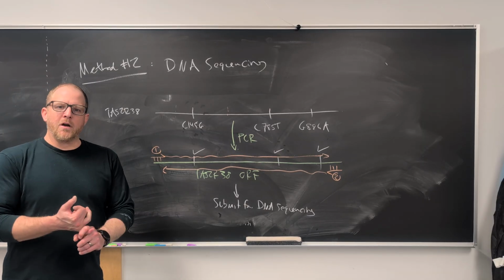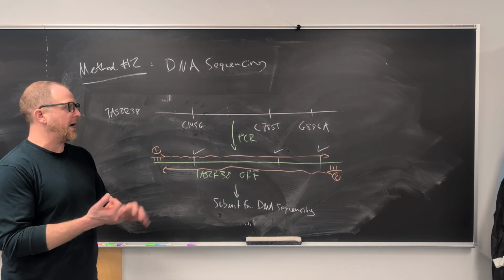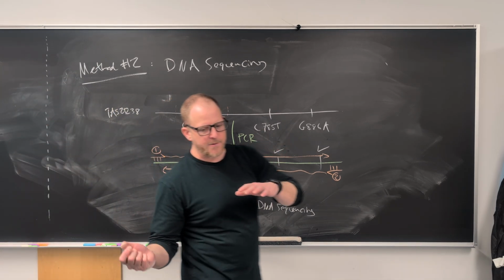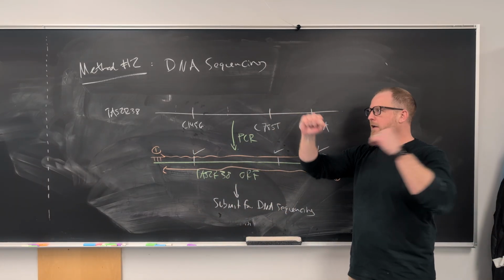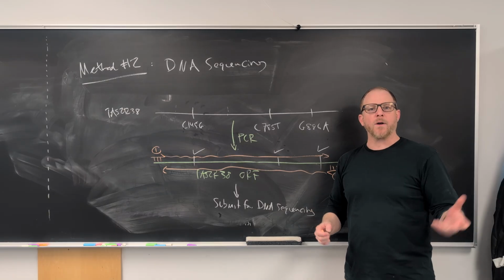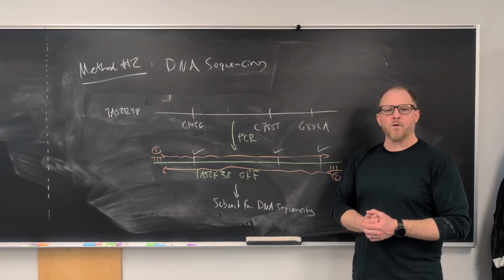Yeah, pre-lab is due before lab starts this week. It should be a fun lab. It's 4 weeks. We'll be switching back and forth between this dCAPS method and the sequencing method, so really do your best to wrap your heads around each of those two things. As we move through the 4 weeks, I'll do my best to make sure we're all on the same page. Should be a fun lab. Looking forward to it. Thanks.